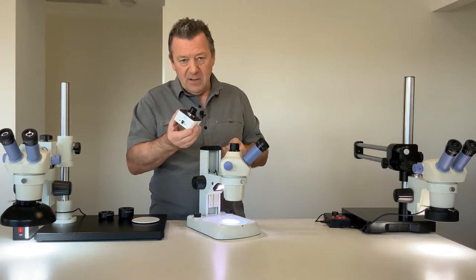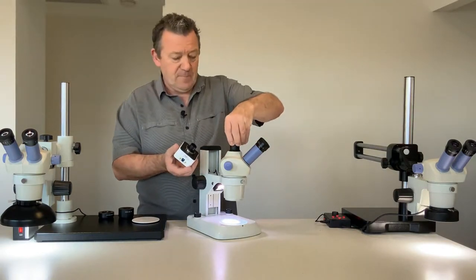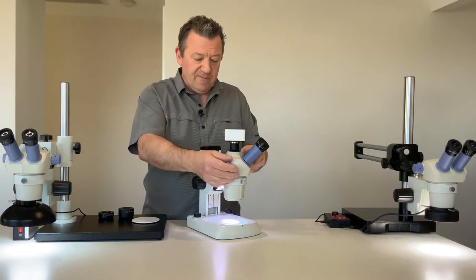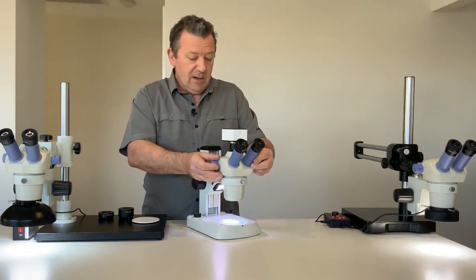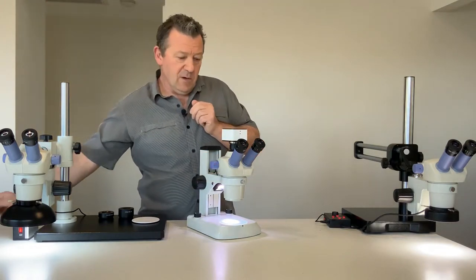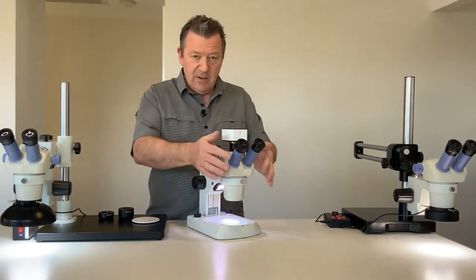We have a large range of optional digital cameras. This range is our standard range and these are available in 2 megapixel, 5 megapixel, or 12 megapixel. These are USB powered and come with software, so basically you can view your specimen on your computer screen without looking down the eyepieces.